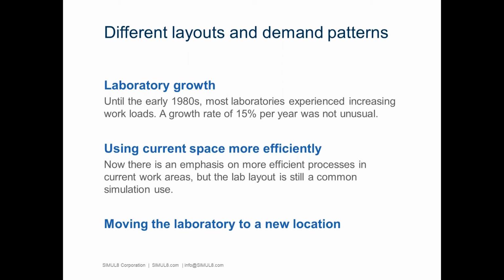So it integrates really well. And what they're looking at is how their track system can improve a lab process, and that can translate to small, medium, or large labs. And we're starting to find some real benefits of using simulation to show this. And this is a project which is continuing today, actually.